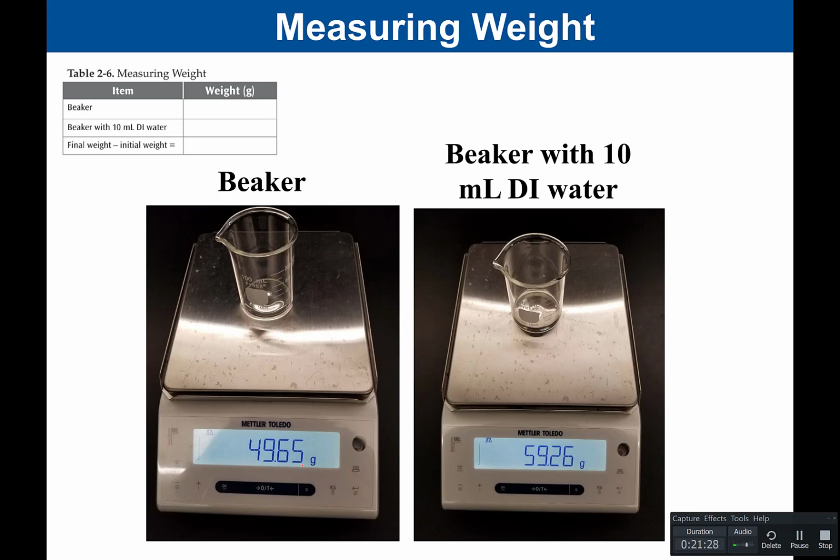And so this is going to see, did the water weigh 10 grams? If it did not, you're going to see in your summary questions, you're going to address why that weight might not have been 10 grams. And we'll talk about that more in a little bit.